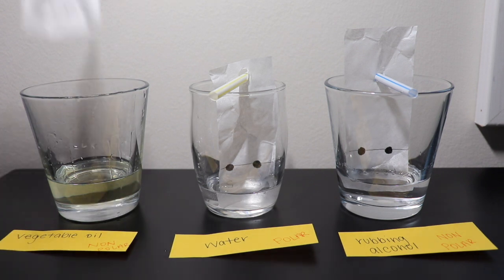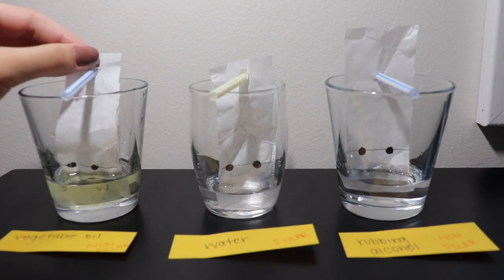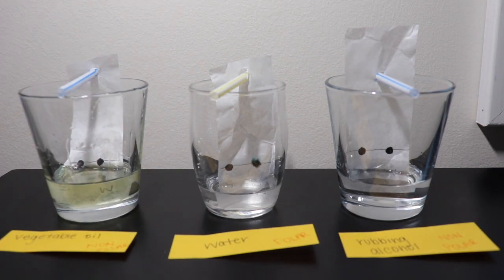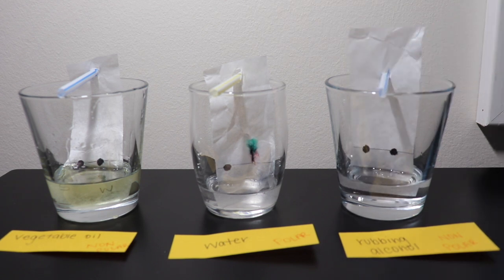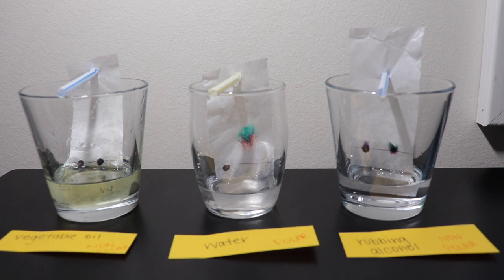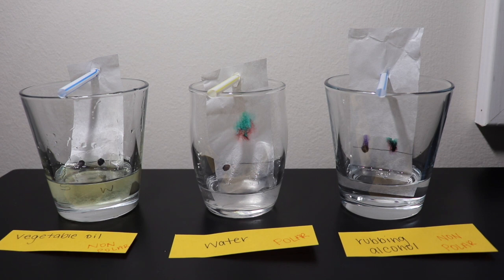Label S the dot with Sharpie, which has nonpolar ink, and label W the dot with washable marker, which has polar ink. As the solvent, which is the liquid at the bottom of each cup, moves up the filter paper, depending on the polarity of each component of the ink, it'll separate the ink into phases. Each color pigment has a certain polarity different from each other, and this is why chromatography works. Because each pigment has a different polarity, it allows a mixture to separate and show all of its components.